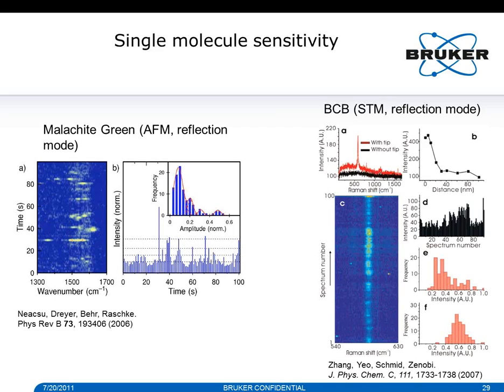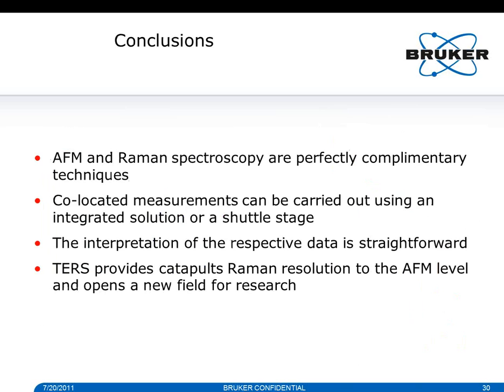So it's a great technique. It certainly needs more research before it becomes something that an industrial customer would use. But it's an interesting field to do research in. Things look different in the near field, and it definitely gives you a lot of research areas to work with. If we conclude up to this point, I think we've seen that AFM and Raman spectroscopy are just perfectly complementary techniques.